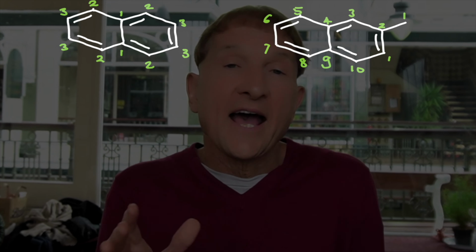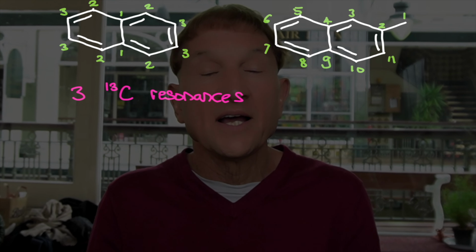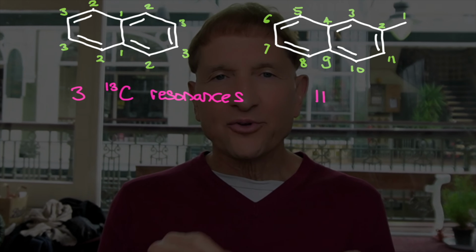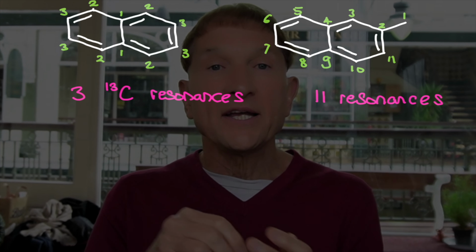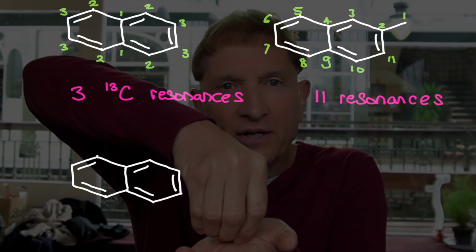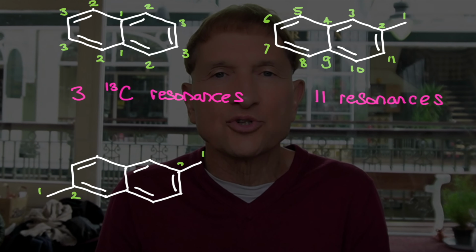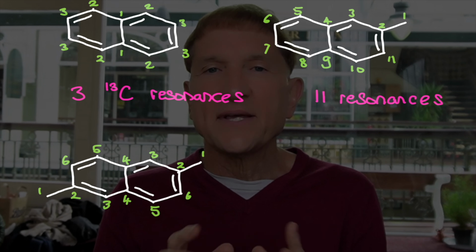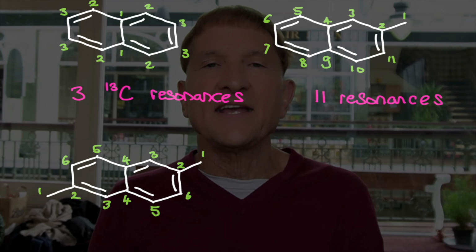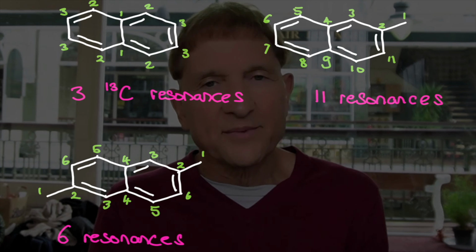They may accidentally have the same chemical shifts or chemical shifts so close that you can't tell them apart, but mostly they won't. Putting a methyl group exactly here increases the symmetry by introducing a point of rotation, even though there are no planes of symmetry other than the one that the naphthalene rests in. That means I count 6 inequivalent carbons for this molecule. Check, because I often make mistakes.